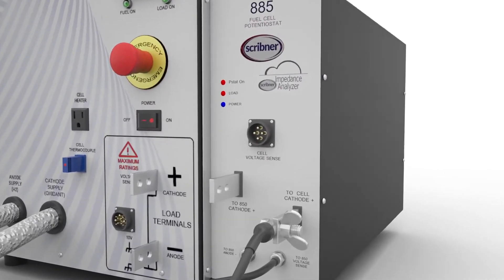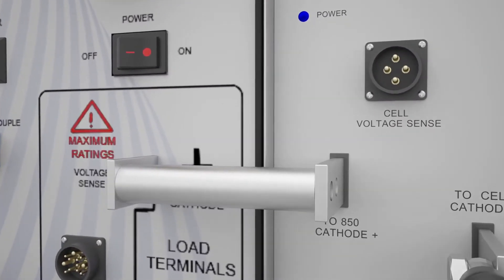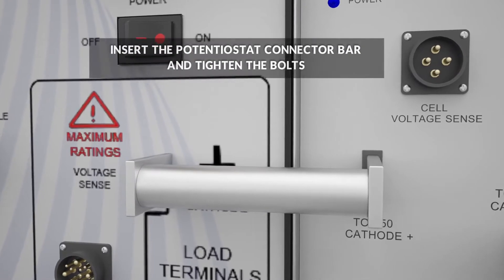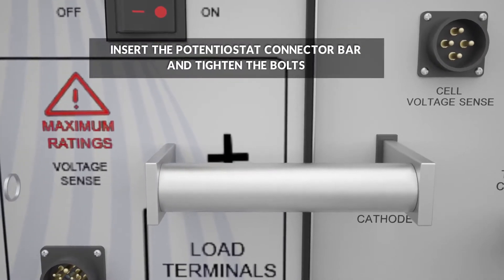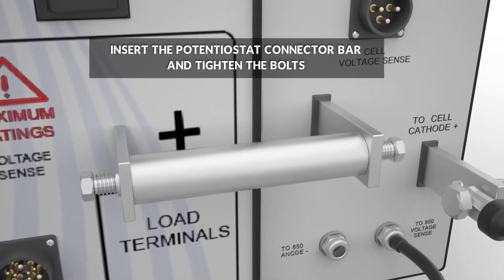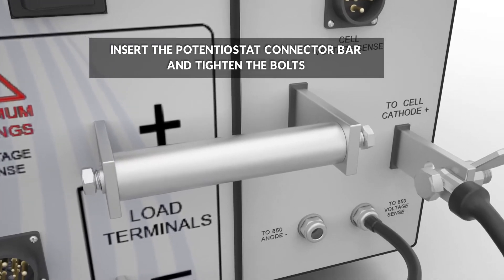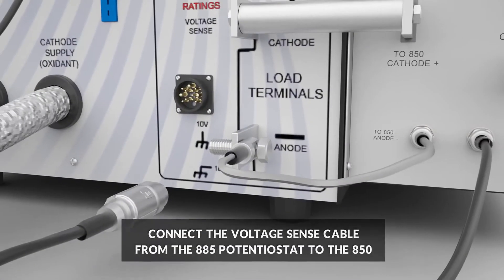On the front of the 850, insert the potentiostat connector bar between the 850 positive bus bar and the upper 885 potentiostat bus bar. Tighten the connector bar bolts with a wrench.